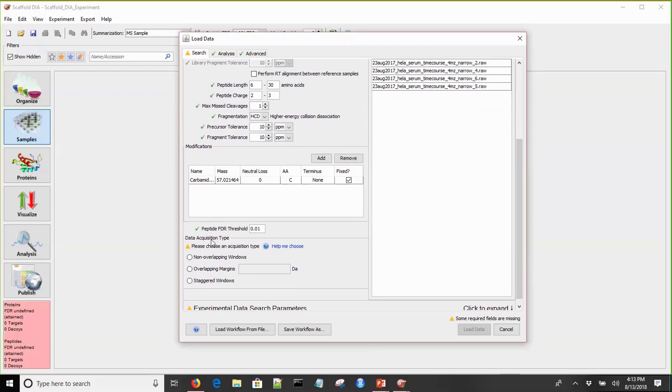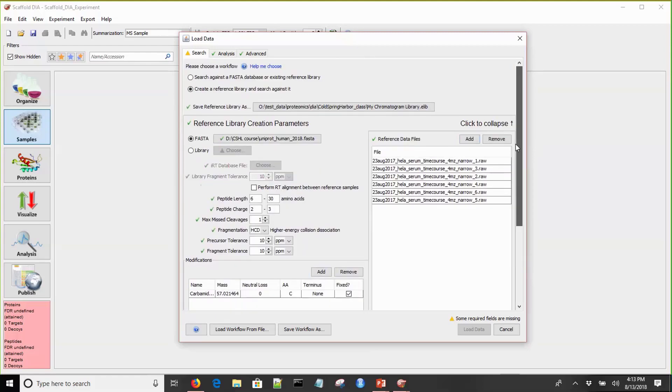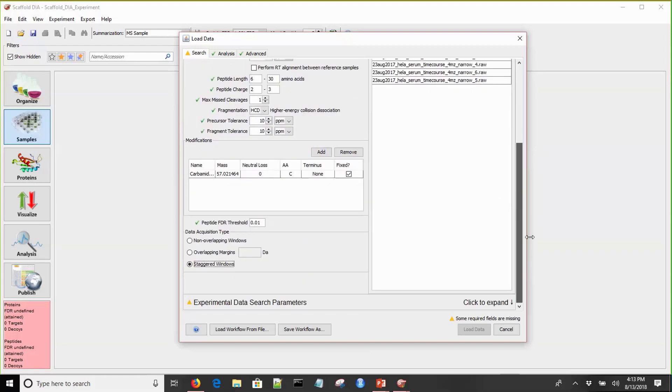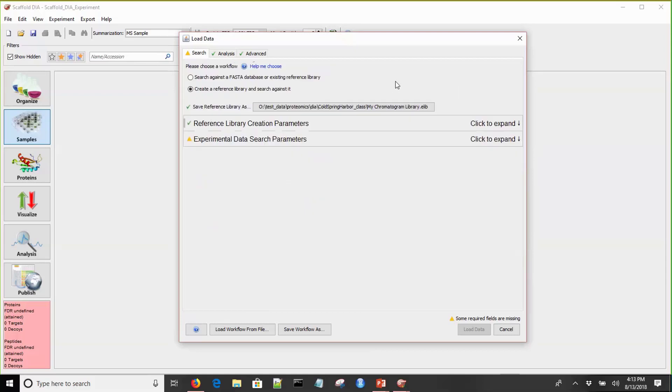Next is the data acquisition setting. This should match how your windowing scheme was set up when you collected the data via your mass spec. We'll set this to standard windows because this is standard window data. Once I've set that parameter, all the reference library creation parameters are set, and we don't see any more triangles there.